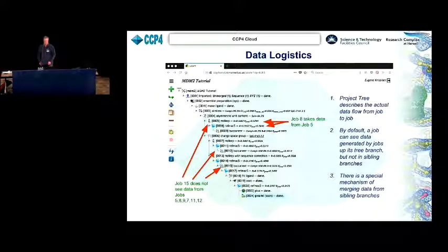This has the benefit that it is much easier to choose the input data for each job, which is beneficial if there are many dozens of jobs in the project. But in some cases, you need to merge data from different branches or move one job to a higher level. But this is rarely the case.